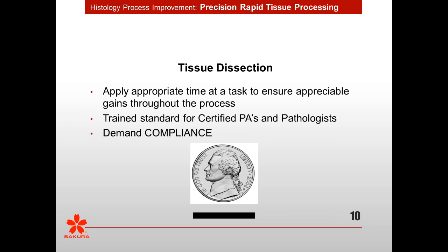And again, trained standards for certified PA, it's already there, cutting to this nickel size. We just have to demand compliance, that it's not acceptable not to hit this precise small variation sample size.